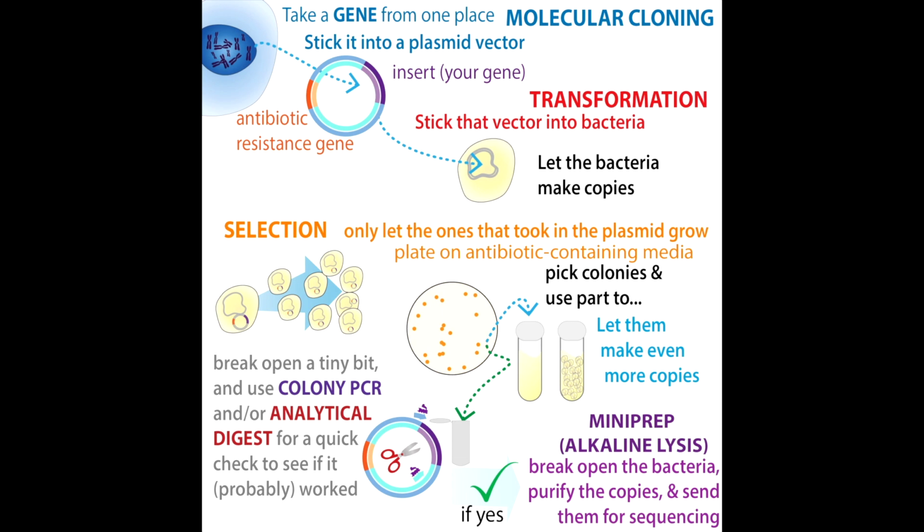So we just basically keep it warm. And you want to make sure that you put the plates in upside down, so that condensation doesn't form on the top and then drop down and mess things up. So usually, depending on the strain or whatever, it'll take about a day.